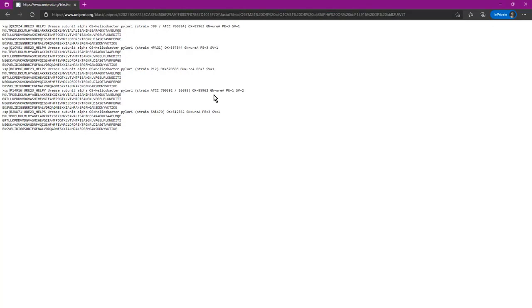Now that you have downloaded the FASTA file with the sequences, we will compare them to each other by performing a multiple sequence alignment. A multiple sequence alignment is an alignment of 3 or more biological protein or nucleic acid sequences. Usually, these sequences are of similar length, and from the output, evolutionary relationships can be inferred.